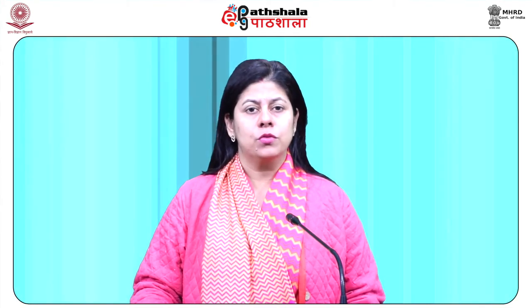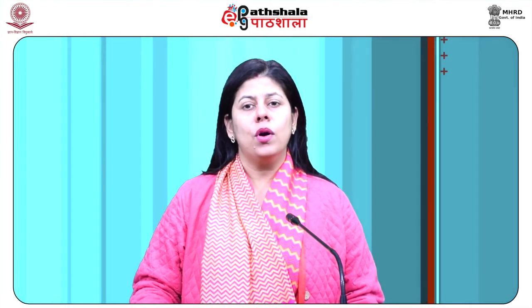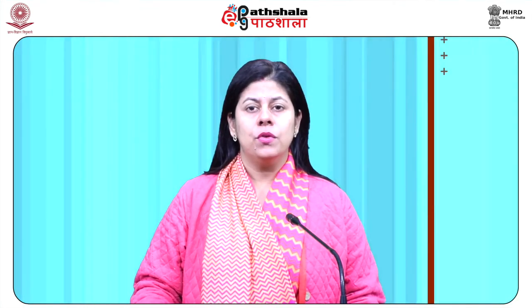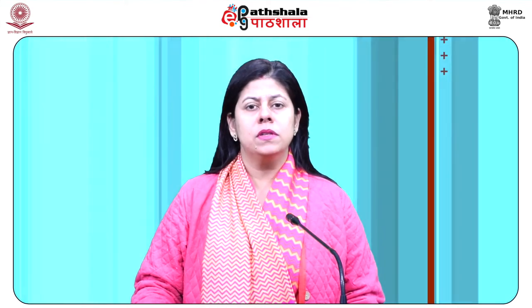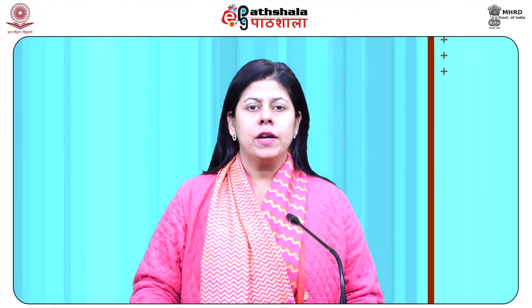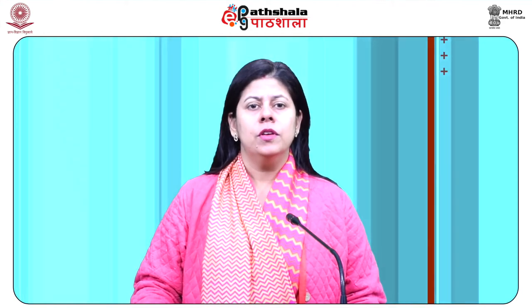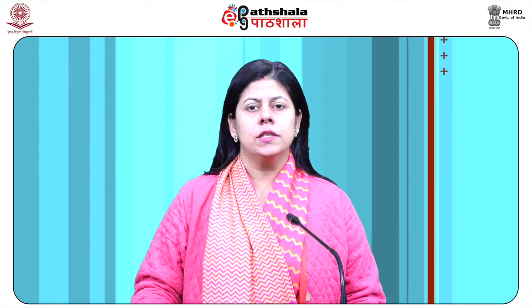A simple microscope is a microscope that utilizes one lens for magnification and is the basic framework of the light microscope. Von Leeuwenhoek microscopes comprise a small single converging lens attached to a brass plate with a screw apparatus to support the sample or specimen to be examined. Stereo or dissecting microscope is an optical microscope type fashioned for low magnification examination of a sample using incident light illumination rather than trans-illumination.